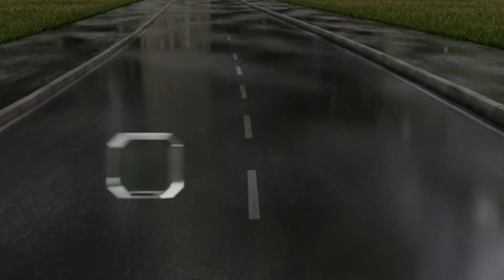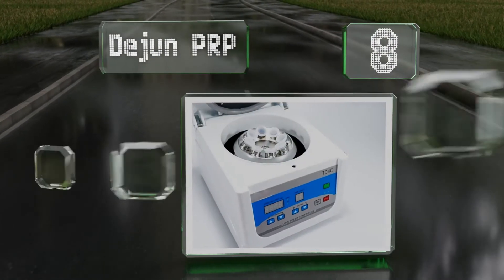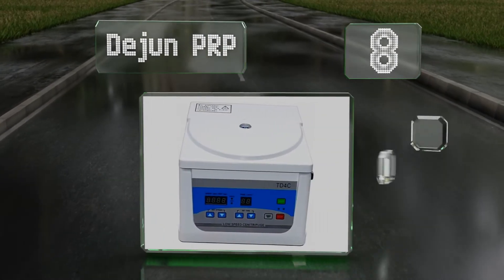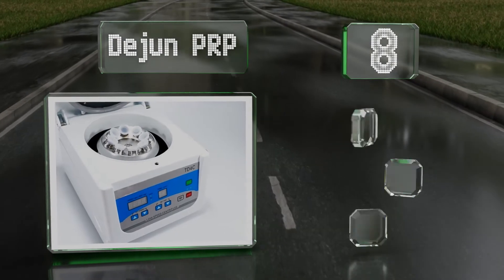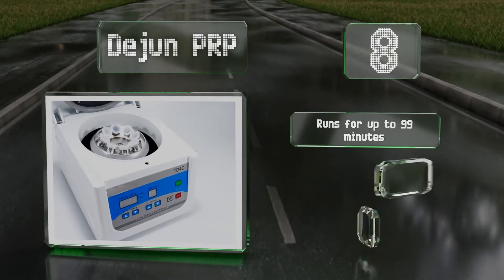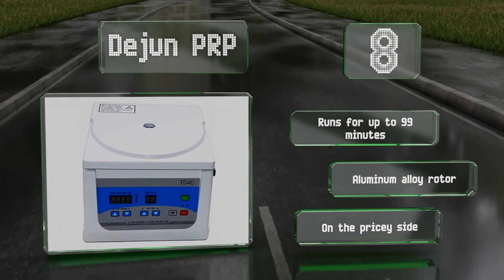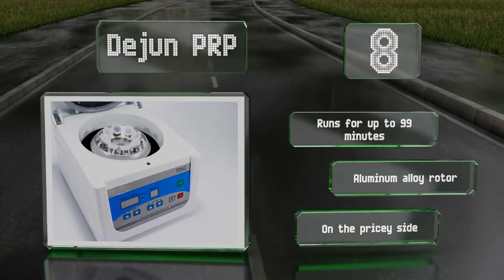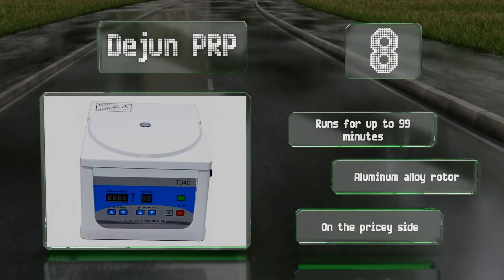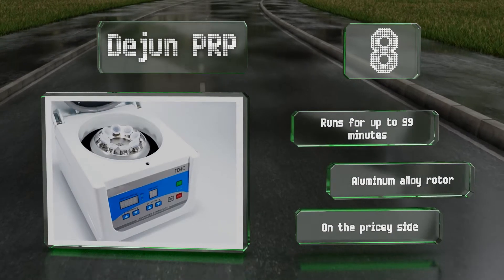Starting off our list at number eight: given its relatively small size, it may come as a surprise that the Dejun PRP can hold eight 15-milliliter tubes. It's also one of the quieter options out there, running at or below 55 decibels even at its maximum operating speed of 4,000 RPM. It runs for up to 99 minutes and comes with an aluminum alloy rotor. However, it is on the pricey side.